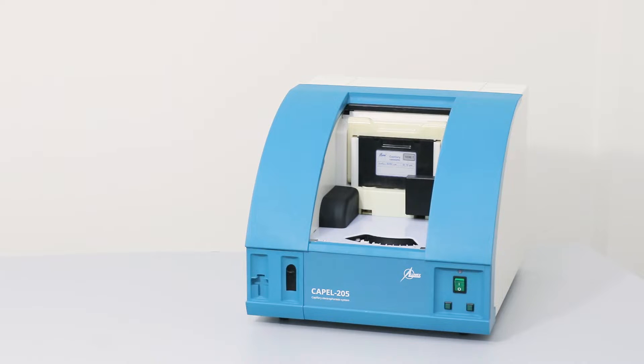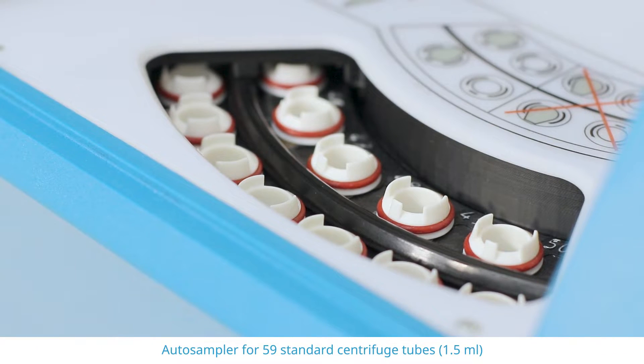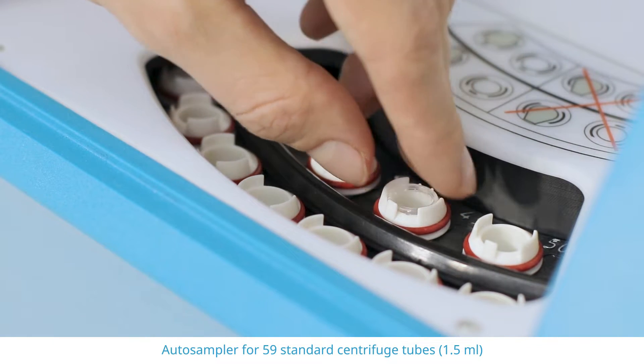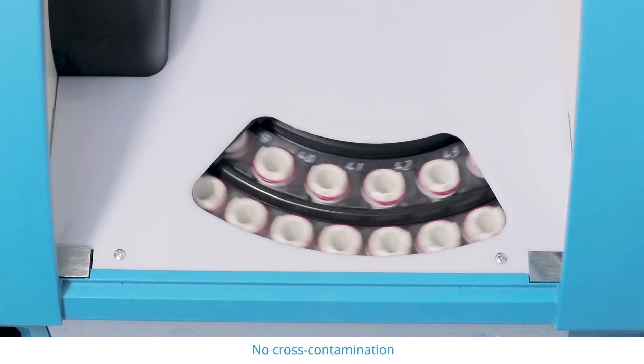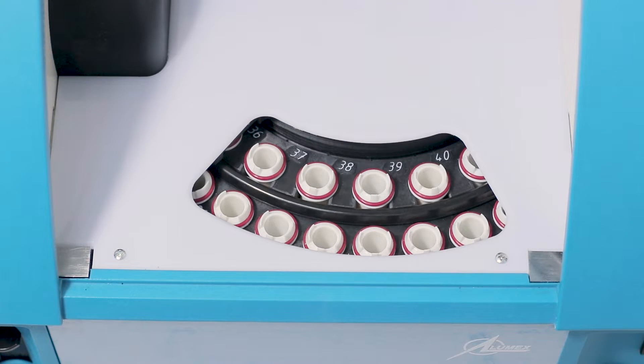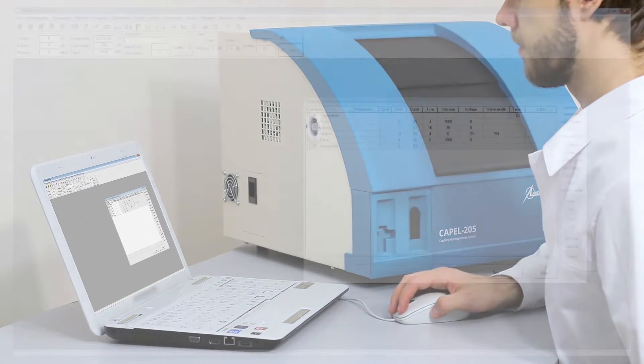The instrument has a high-capacity autosampler of 59 positions for standard centrifuge-type tubes, which is a cost-effective solution for both high-throughput labs and laboratories with just several samples per day.